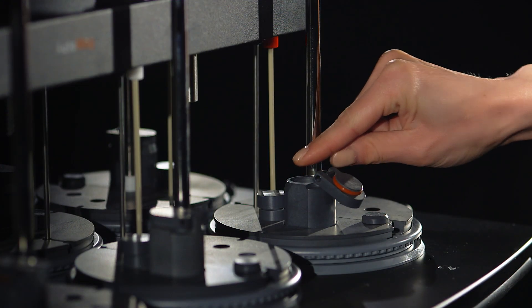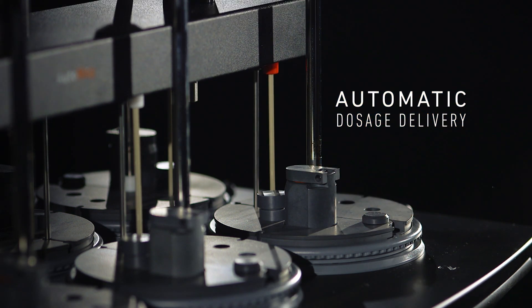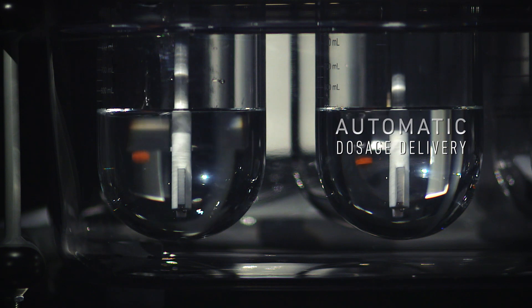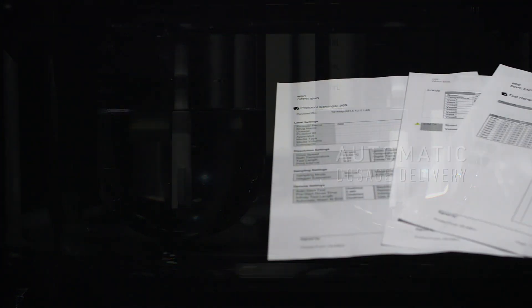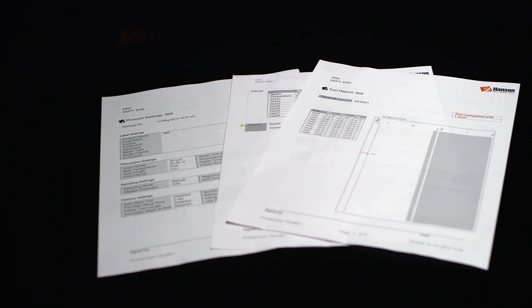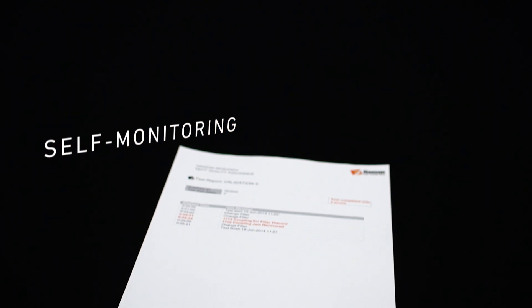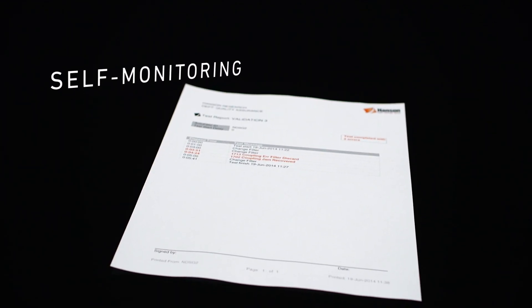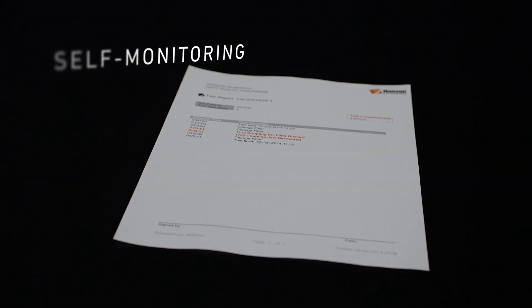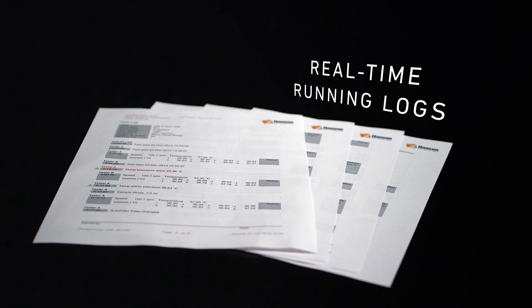Save time and eliminate dosage delivery variability with the automatic dosage delivery CS covers. Keep track of method details while reducing the amount of handwritten logbooks with the most advanced reporting in the industry. An advanced self-monitoring feature highlights problems in red for easy identification on reports. Print a real-time running log from a Hanson validation printer or a standard PC network printer.